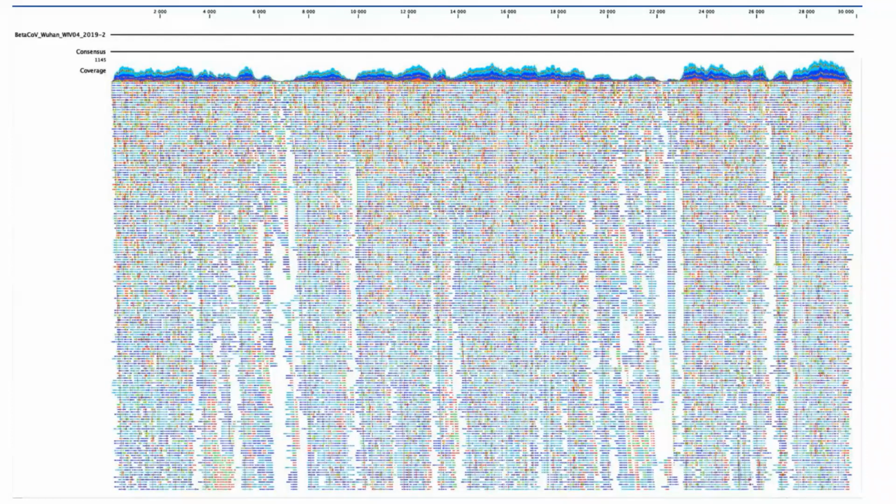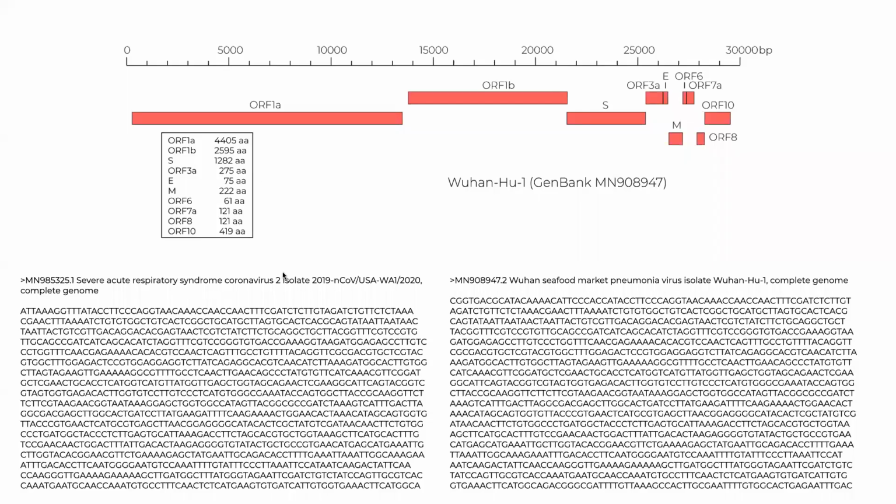And then we also talked about the different types of formats. So we talked about FASTQ files. FASTQ files are those reads that you just saw previously. FASTA files, sequences of nucleotides or amino acids, and the GTF or the GFF format, the format that represents the positions of different sections in the genomic sequence that we're using for reference.